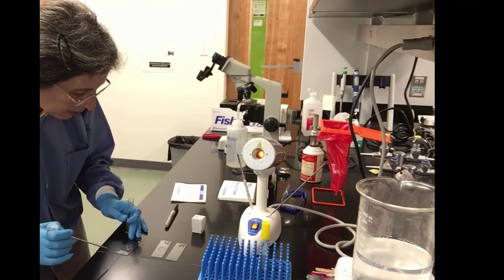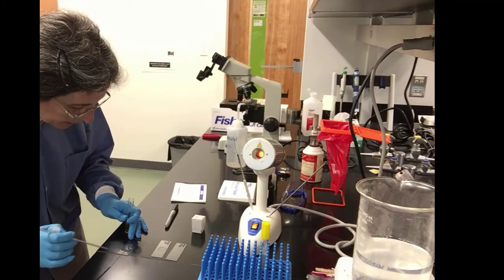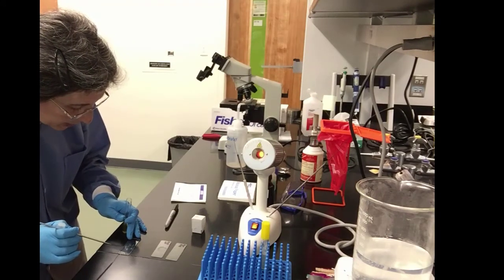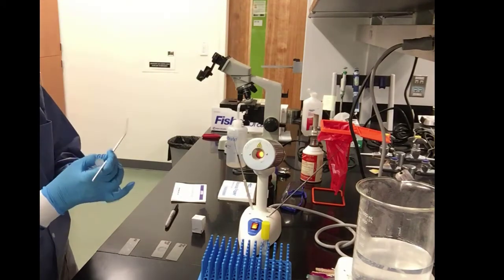So this now will contain both the staph and the Mycobacterium specimens. Make a quarter-sized smear. Smearing is very important here, so we have to make sure we have good smears.